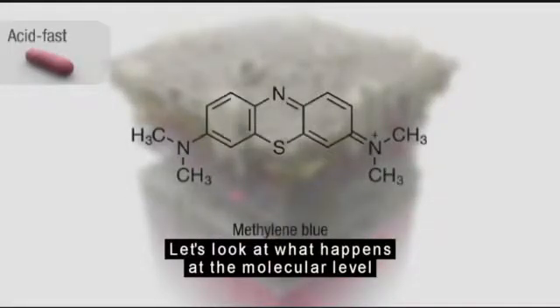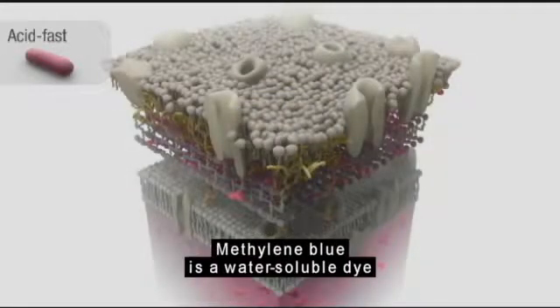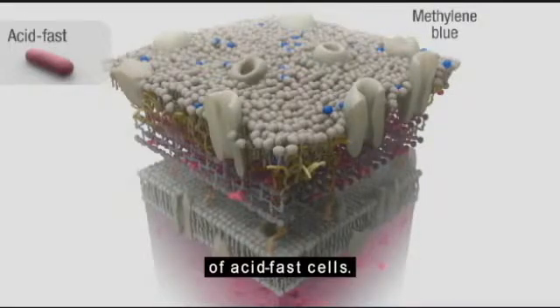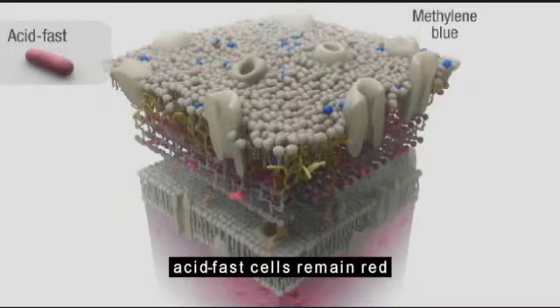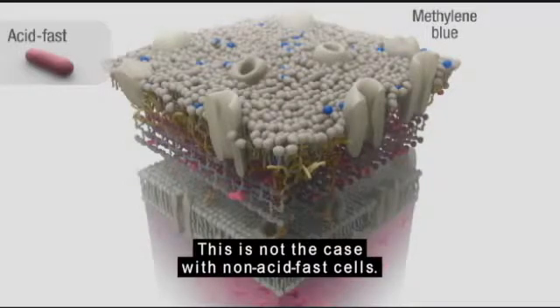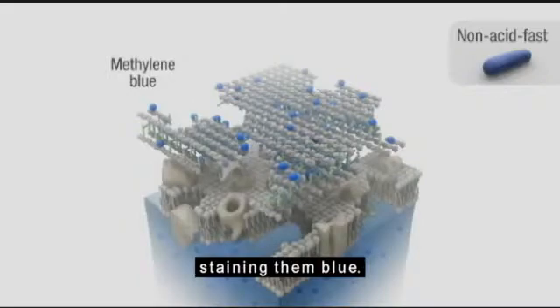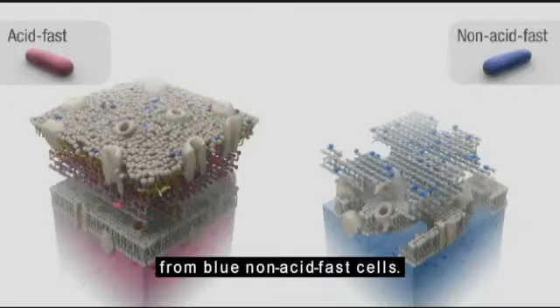Let's look at what happens at the molecular level when methylene blue is added to the smear. Methylene blue is a water-soluble dye that cannot penetrate the waxy mycolic acid layer of acid-fast cells. Thus, at the end of the acid-fast stain, acid-fast cells remain red from the carbolfuchsin primary stain. This is not the case with non-acid-fast cells. Methylene blue easily penetrates the cell wall of these cells, staining them blue. Red acid-fast cells can now be distinguished from blue non-acid-fast cells.